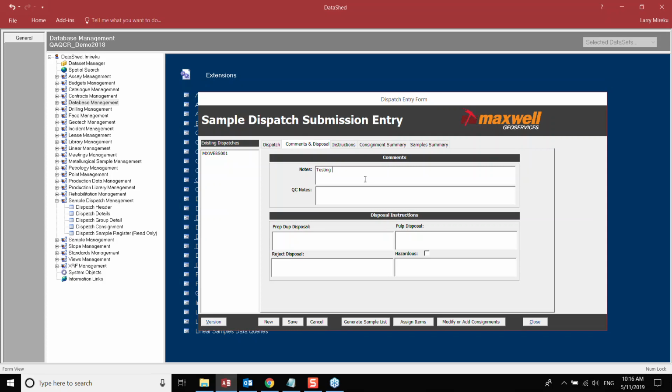So let's say we're testing for webinar samples. You just enter this information, and then what are the quality control notes you want to give to the lab? You can type whatever you want to give to them, but here I'll say follow standard procedures as per contract.